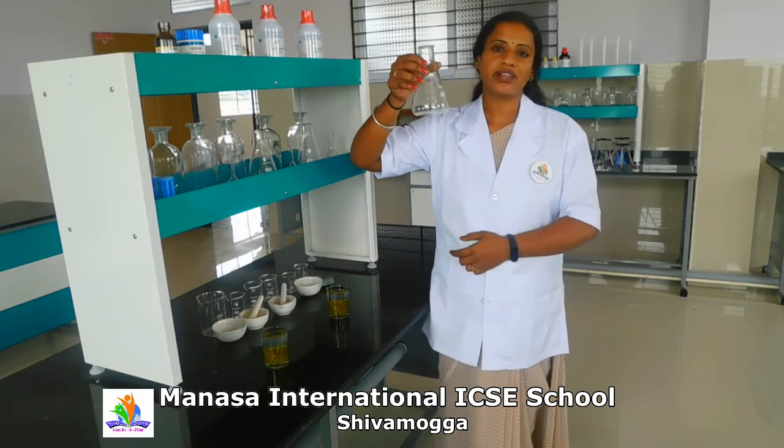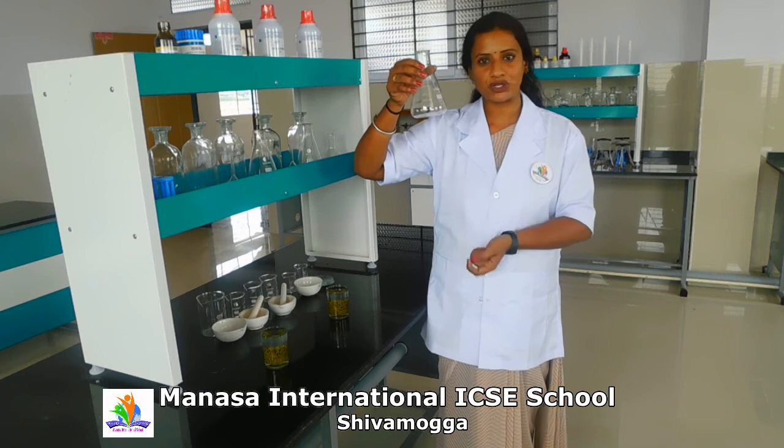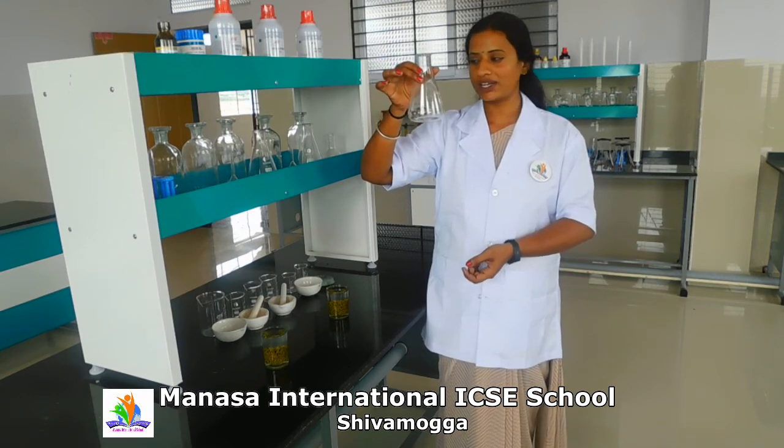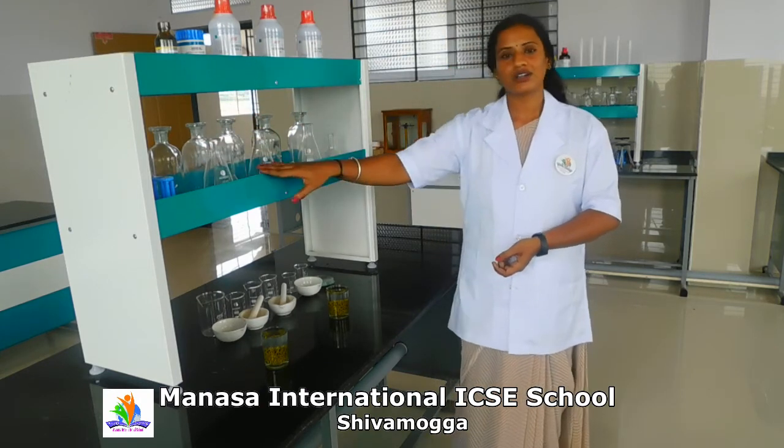which in the coming days we will study in detail: how it is made up, what its measurements and structure are, and what its uses are. This is called a conical flask. Meanwhile, there are many things arranged here. This is the reagent shelf.